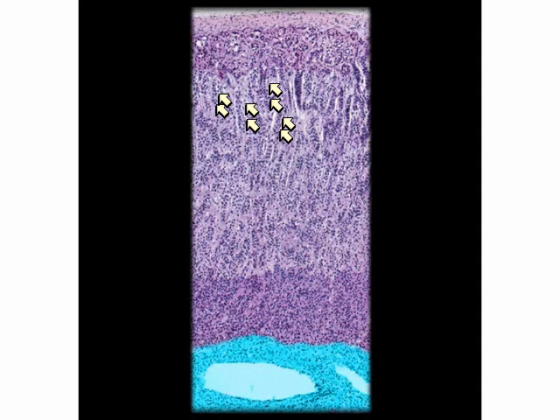All right, that's all. Make sure that you can distinguish the specific regions for each of the slides that I've indicated in the folder on course content for exercise 36.